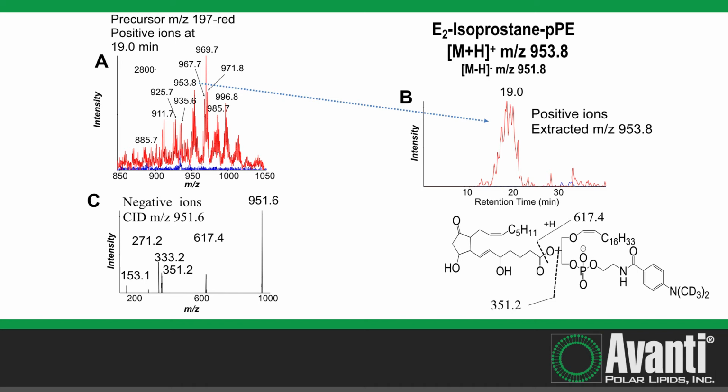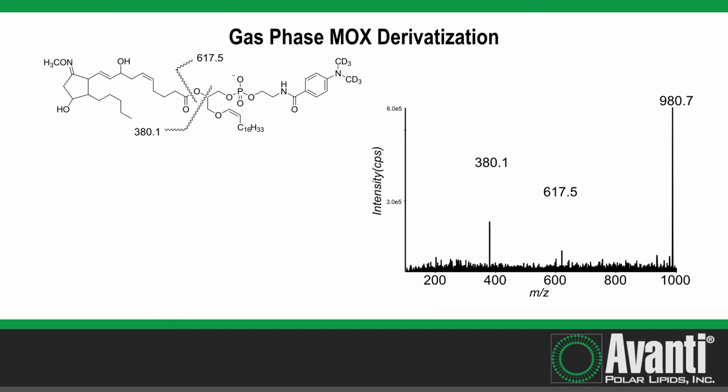So these are families of molecules. In fact, this one structure here is a family of 64 different structures, all of which have different retention times, and so this causes this smear right here. And this is a well-known process of free radical oxidation forming isoprostanes.